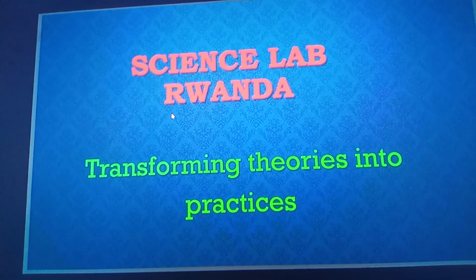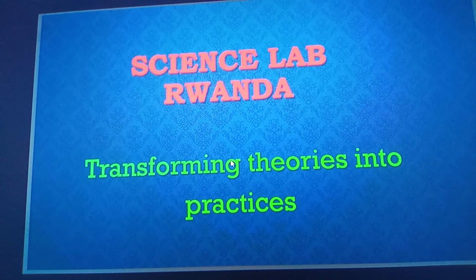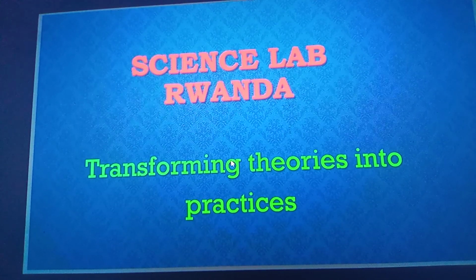As our theme is saying, we need transforming theories into practice. Today we are back. We come to show you different laboratory equipments and their uses. So you are welcome in this session.